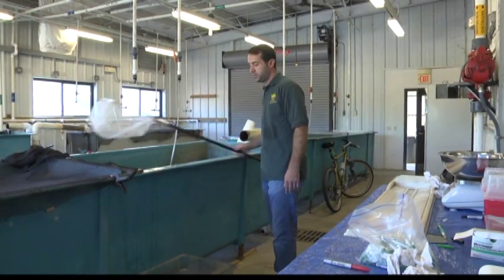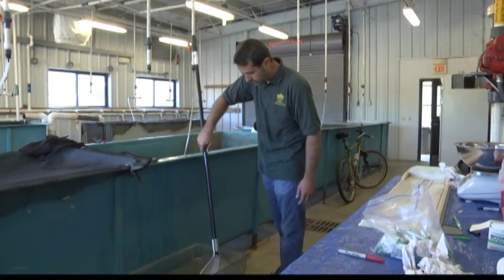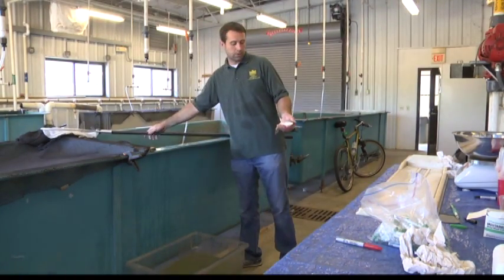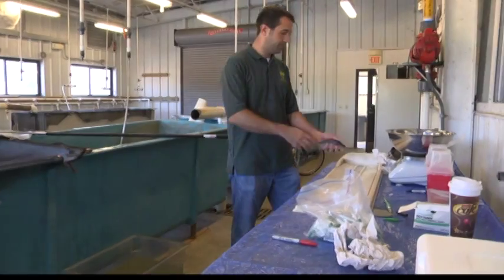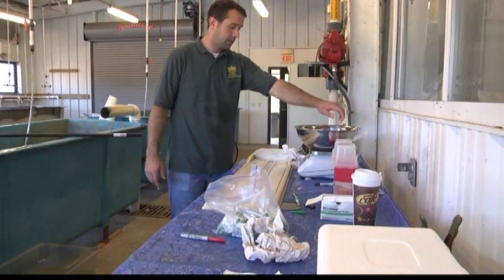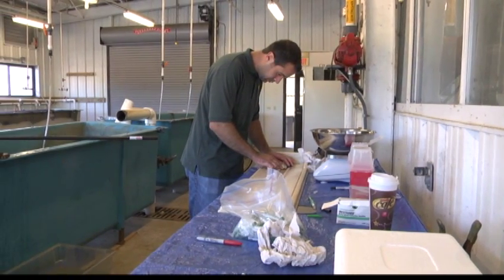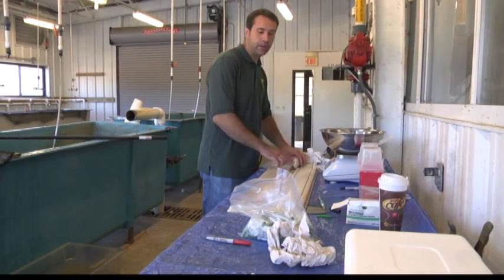I'll get a fish — 182 grams, 20.9 centimeters.